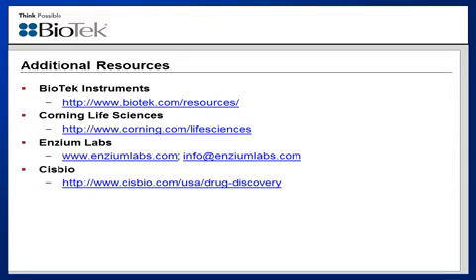If you've ever had to use Matrigel, you'll know that it's extremely important to keep the matrix cool so that it does not begin to gel prior to when it's been properly positioned within the well. So the centrifuge was cooled down to 4 degrees Celsius prior to the centrifugation process.